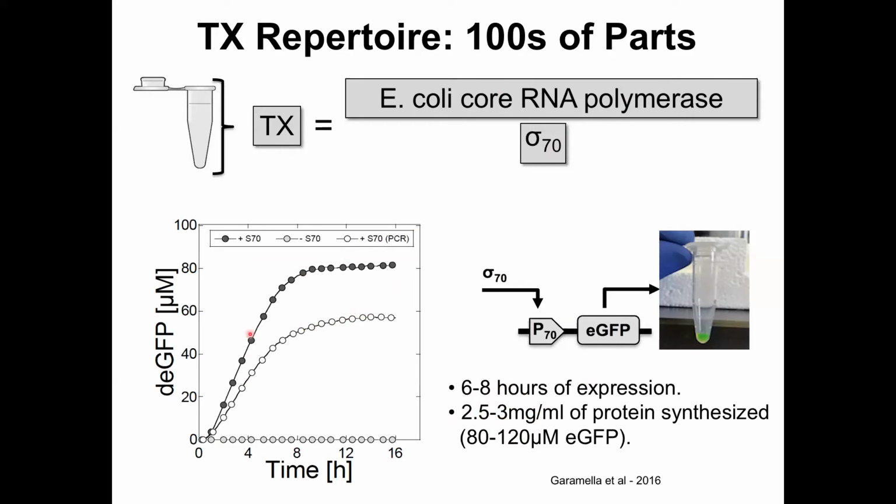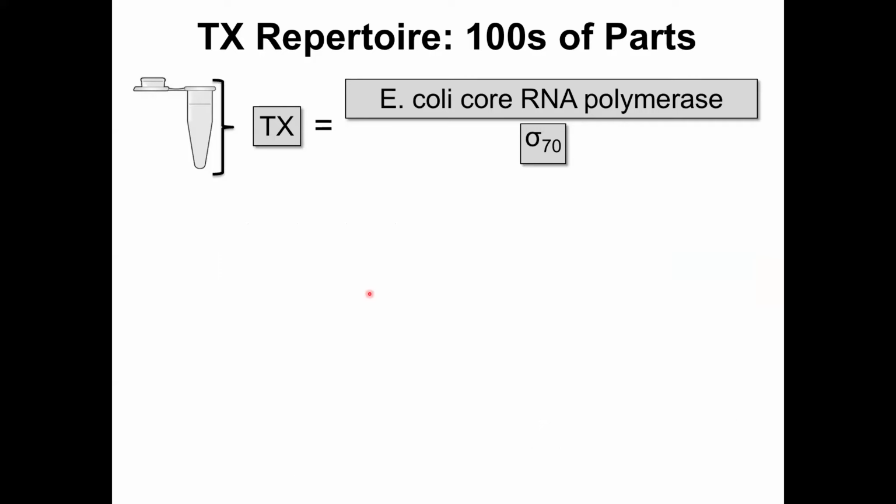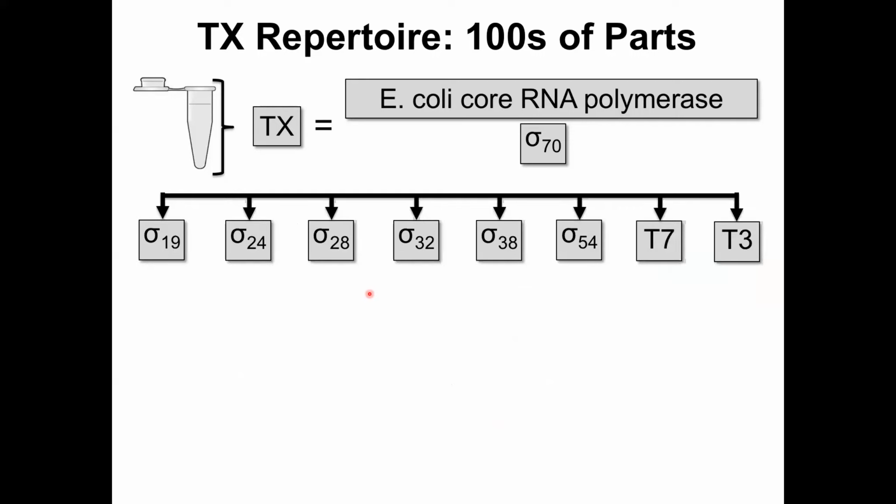So you accumulate the protein and then you reach a plateau where everything has been consumed. It's a chemical equilibrium. There is nothing happening anymore, it just stops here. And so we demonstrated that you can recapitulate the entire sigma factor transcription scheme from E. coli. All of the sigma factors can be expressed and they are specific to their promoters.